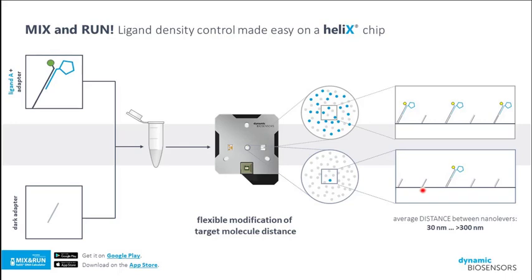So what that does is that it hybridizes onto the surface. It creates what we refer to as dark duplexes. These dark duplexes do not contribute to the fluorescent signal that we use in order to monitor the binding kinetics. All it does is serve to separate between the different DNA sequences that we have on the surface. So effectively, what we understand density to mean is the relative separation of these antigens.